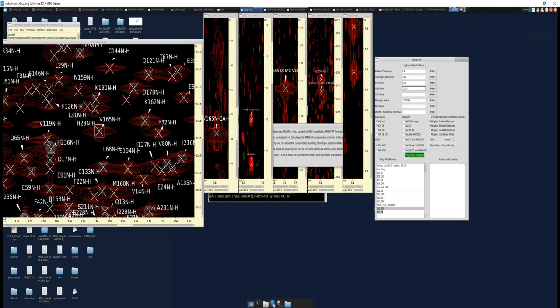But running the NOESY, so this again is sequential, filtering the CACB now only gives you 2, right? And you can see how well this works. Since this is assigned, if we go to its I+1, you'll notice that its nitrogen value is 122.24, and that's exactly the match that we get here.